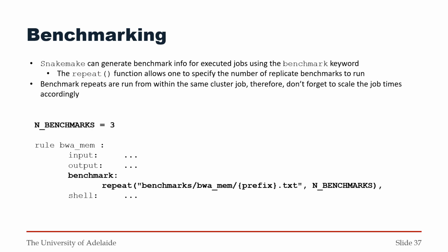And this is really good to have a look to see how the time and memory requirements of a particular rule scale, and you could rerun this potentially with different size data sets and get some idea of how those resource requirements scale and feed that back into this dynamic resource allocation that you specify for a rule, so that you can go easily between different projects, different organisms, and so on.